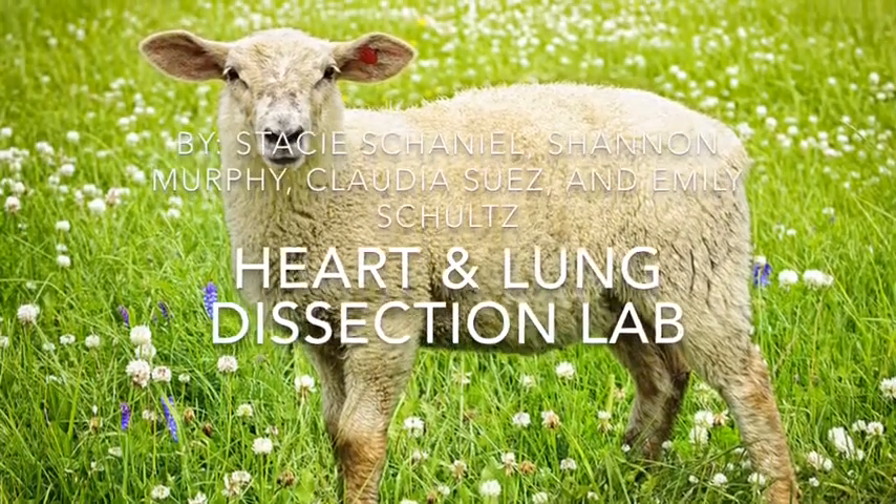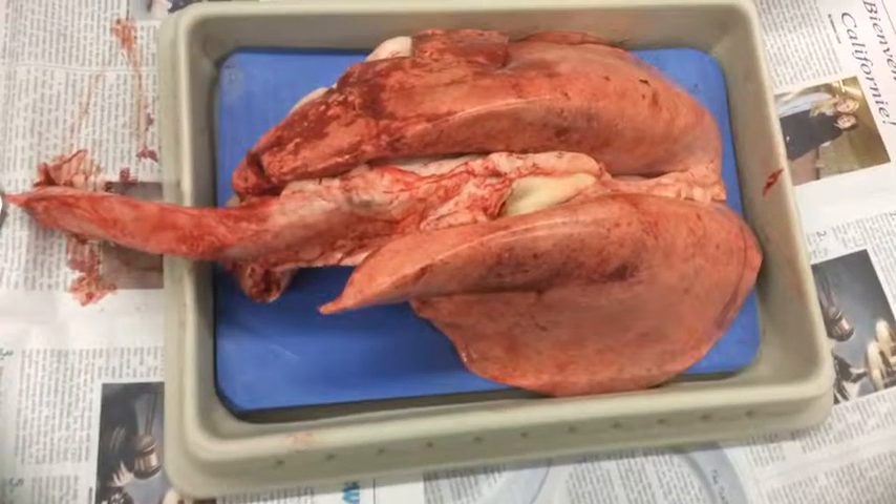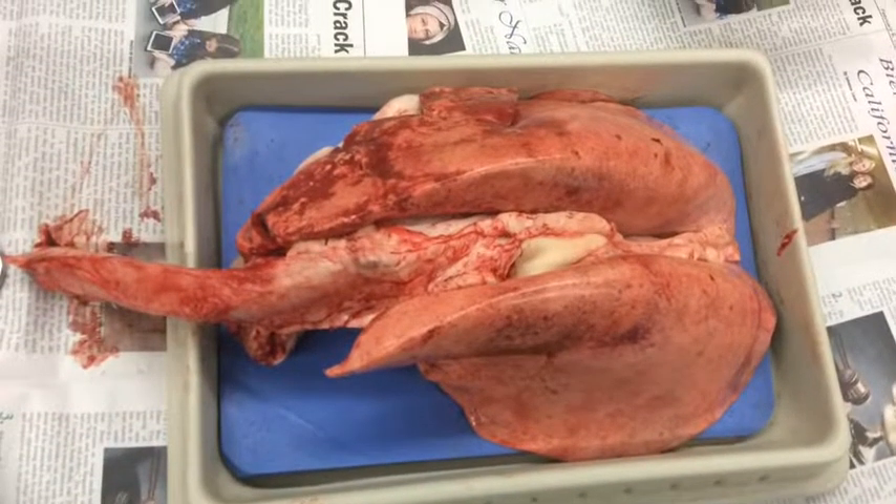This is our heart and lung dissection lab by Stacy, Shannon, Claudia, and Emily. Here is a picture of our heart and lung before we dissected it.